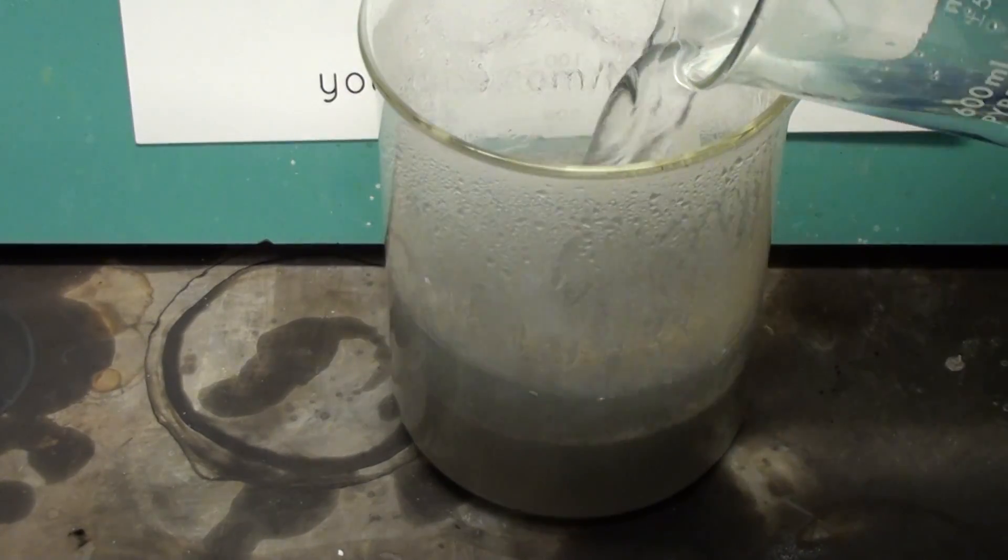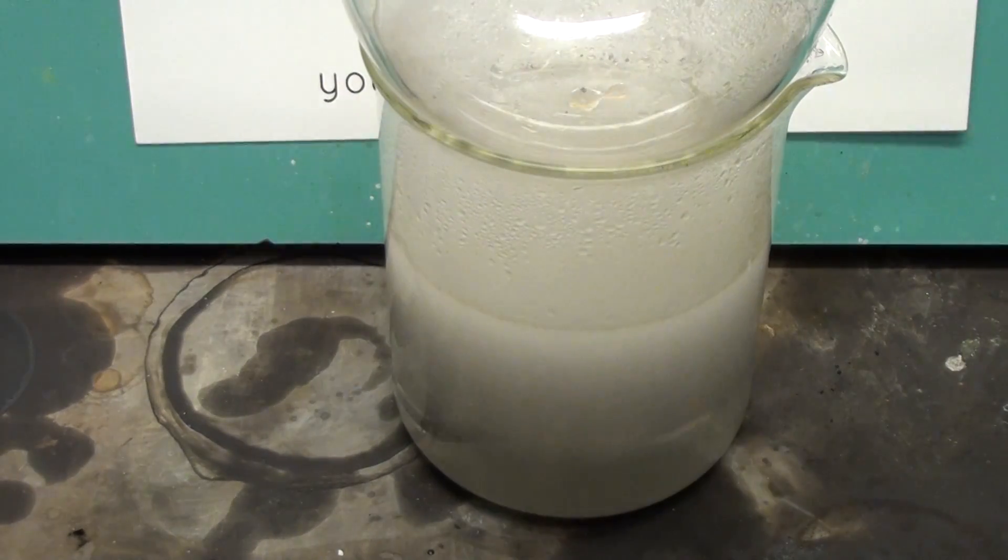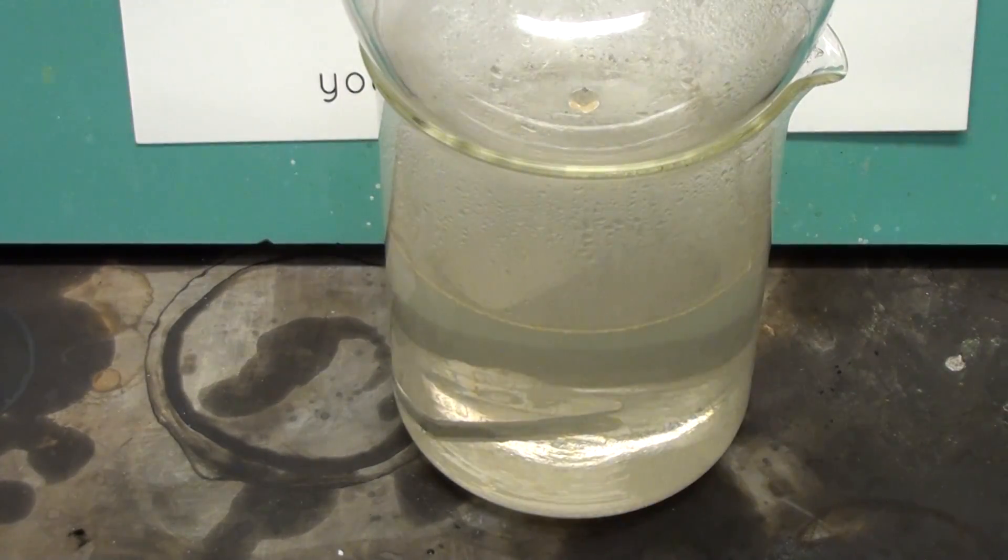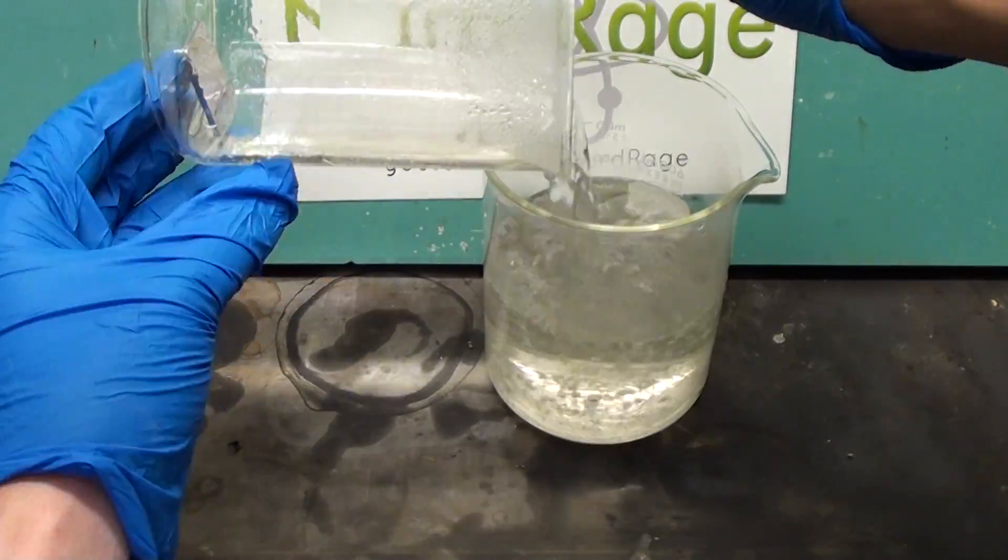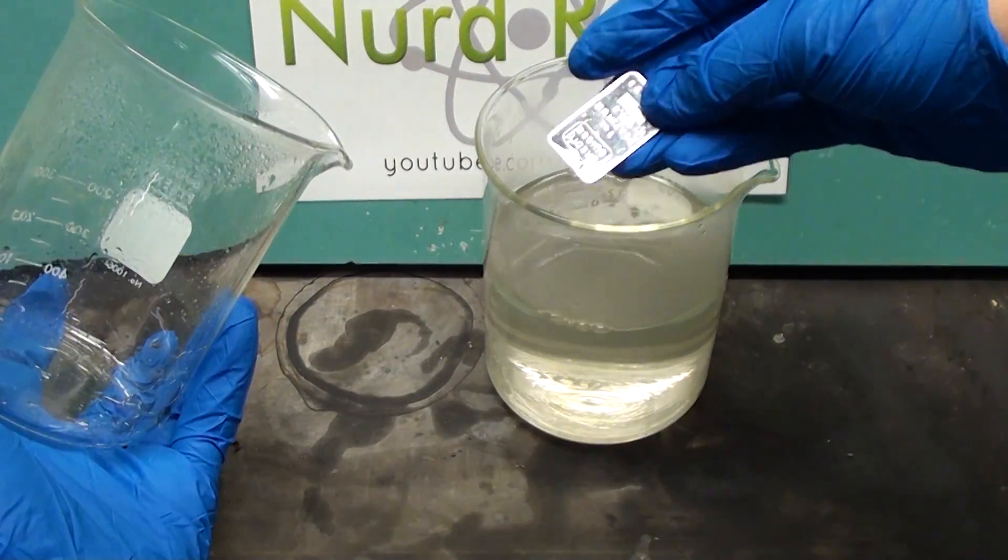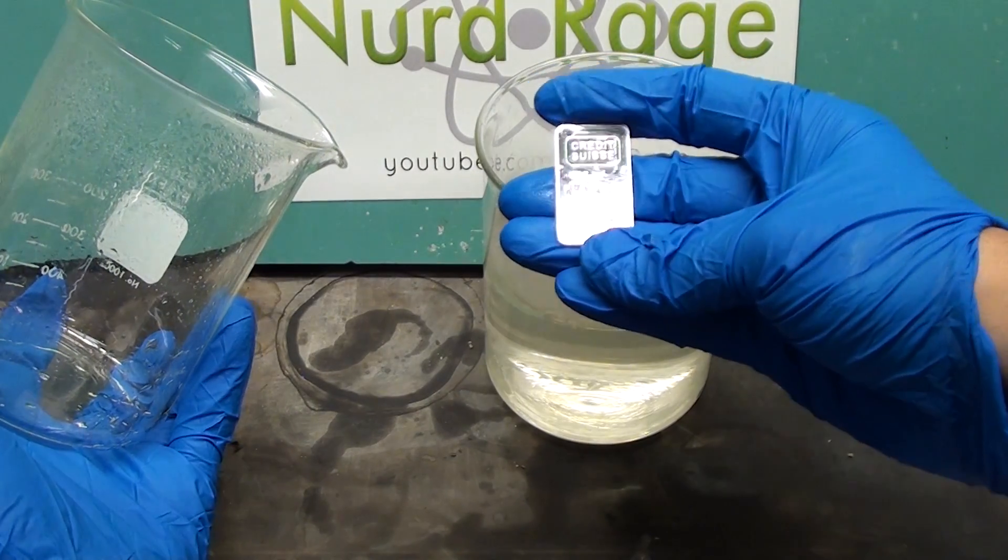I'm going to add some water to completely dissolve it. And here's the platinum bar. Let me get it out of there. The hydrochloric acid completely destroyed the aluminum, but the platinum bar is perfectly fine.